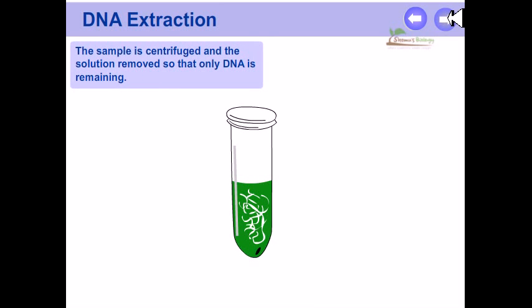The sample is centrifuged and the solution is removed, so only DNA remains in the tube.